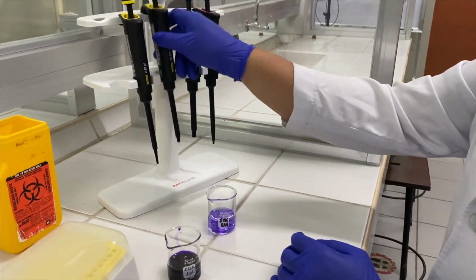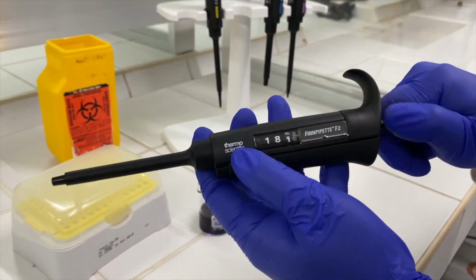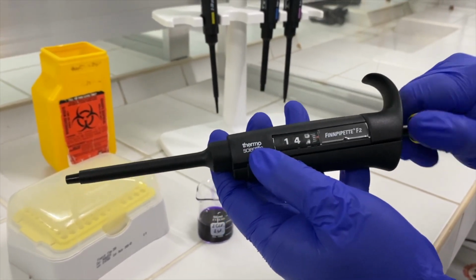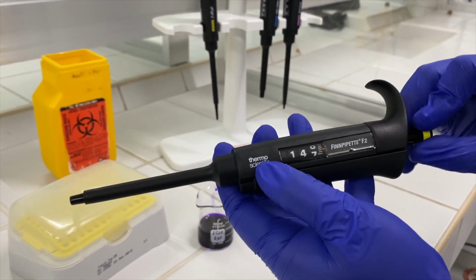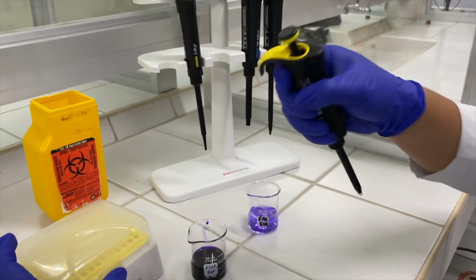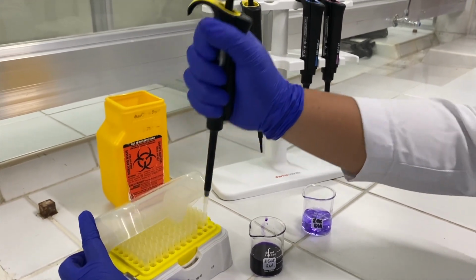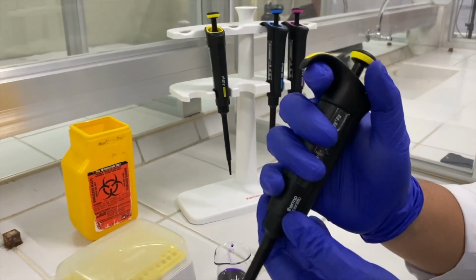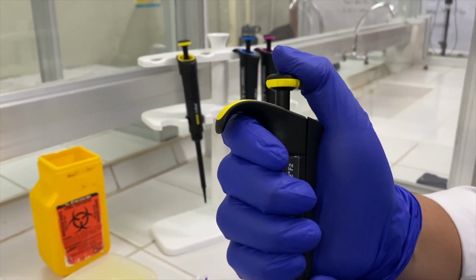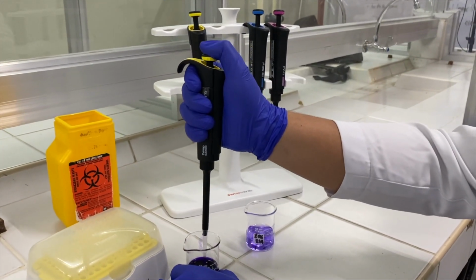When performing the actual pipetting, it is best to select the smallest volume micropipette that will transfer the volume. Set the adjustment knob first to its desired volume before inserting the pipette tip. After that, you can then proceed with the appropriate pipetting technique, which is generally of two types, the forward and the reverse. For the forward technique, press the plunger until the first stop and aspirate the solution by gently releasing the plunger.